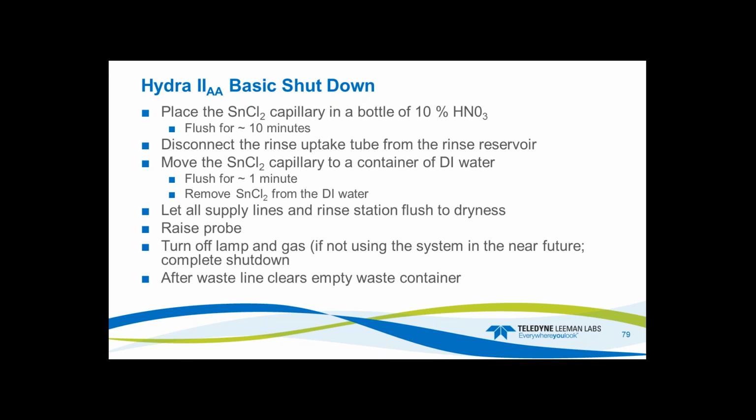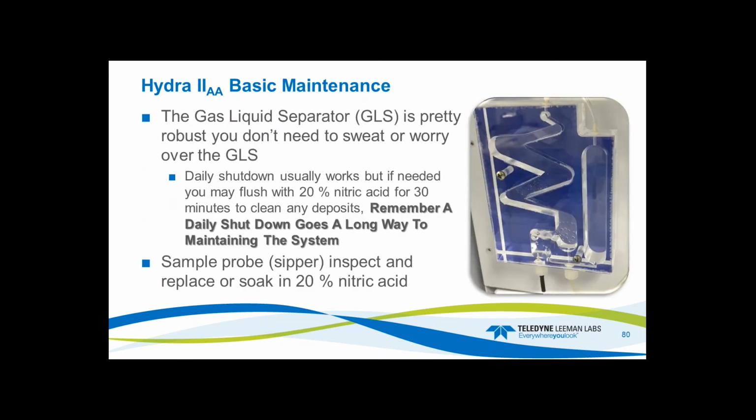Raise the probe, turn the lamp and gas off, and if you're not using it in the near future, just do a complete shutdown. And ensure the waste line clears and the waste container is empty.